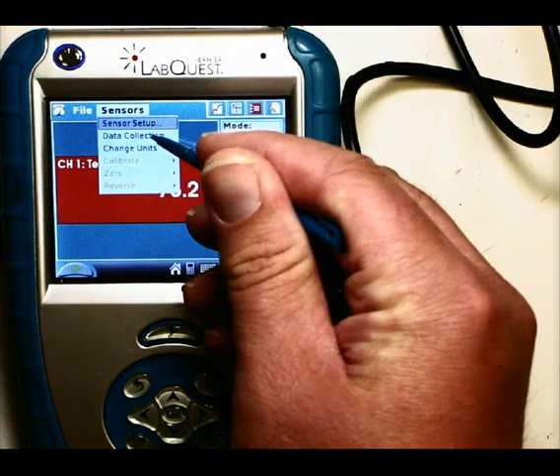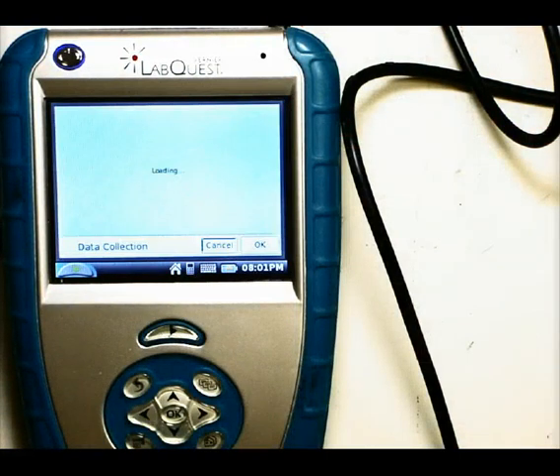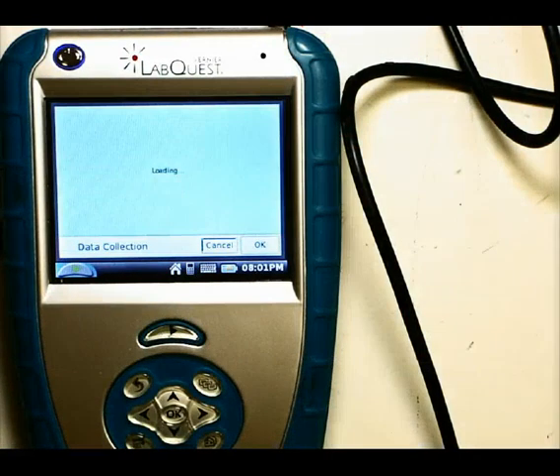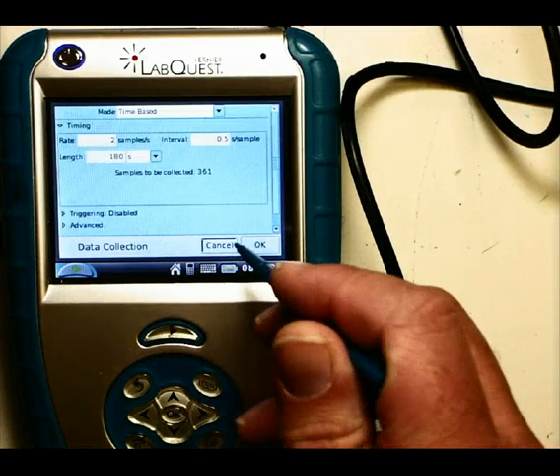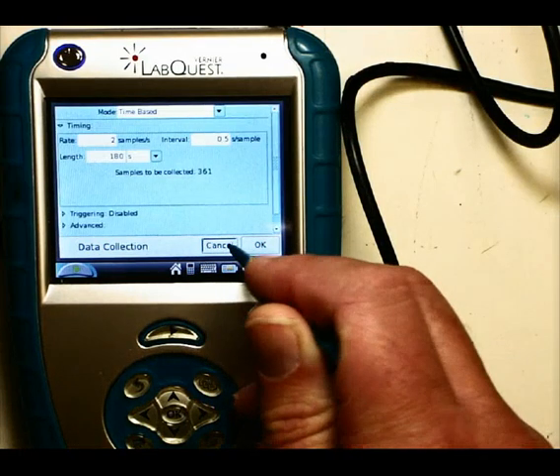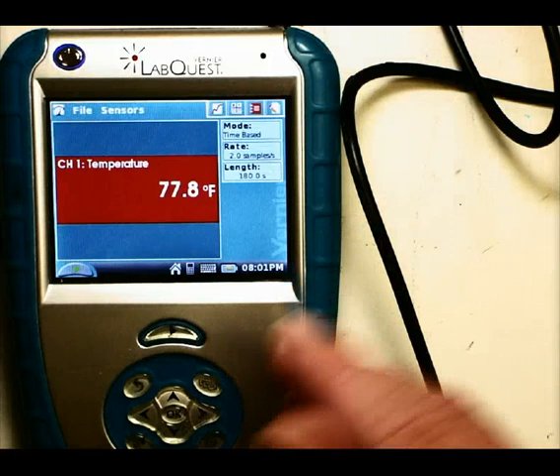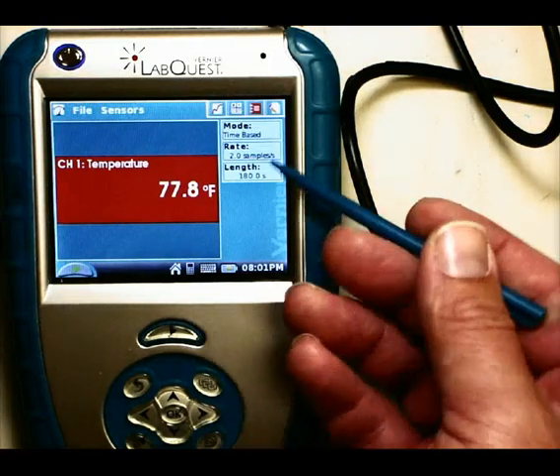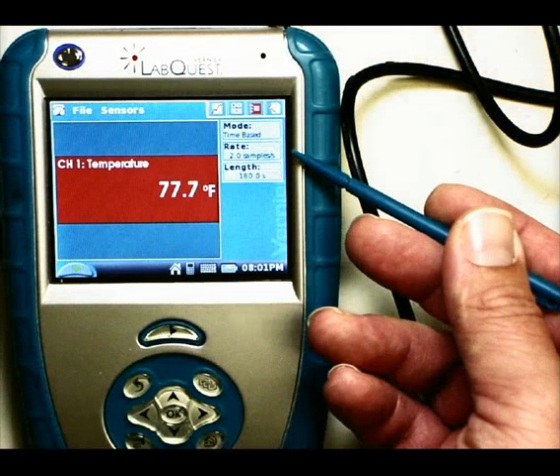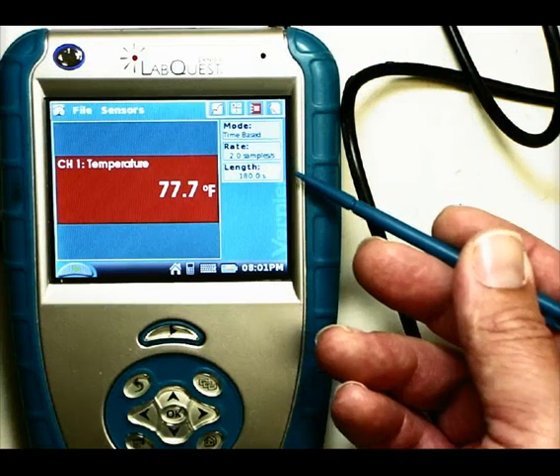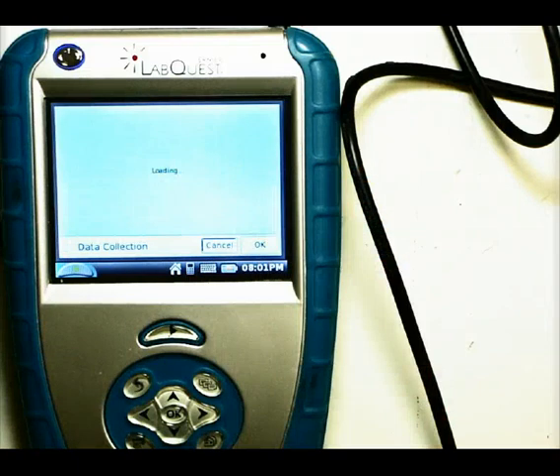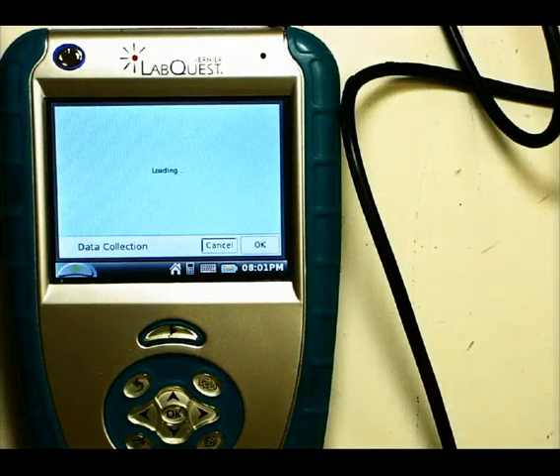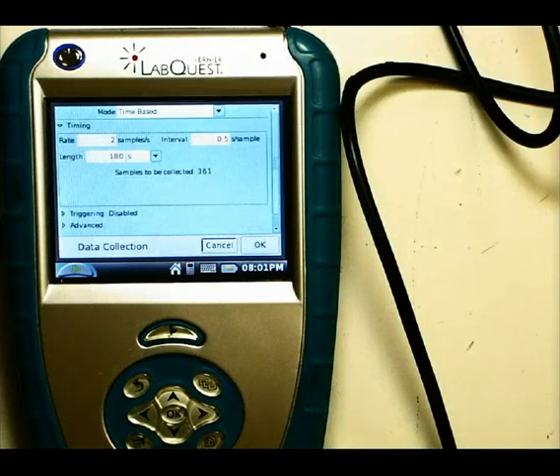I can click on that and you'll see this screen come up — this is the screen we're interested in. There's also another way to get here. Any of these three boxes — Mode, Rate, or Length — if I just click on any of those, it brings up the data collection area as well.